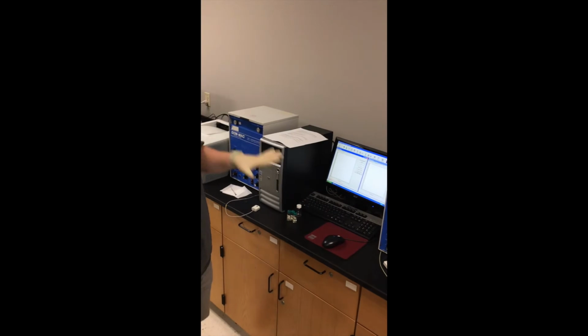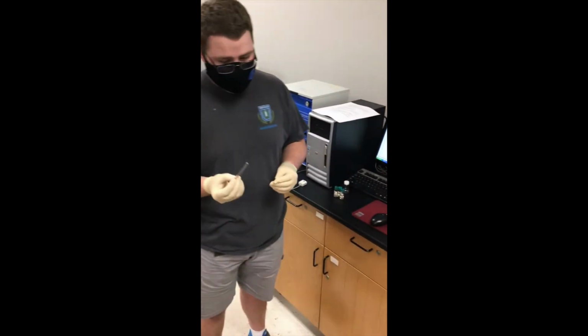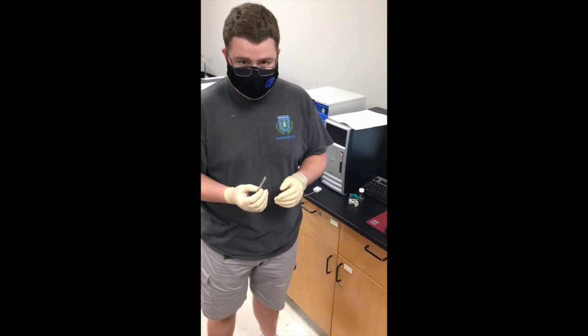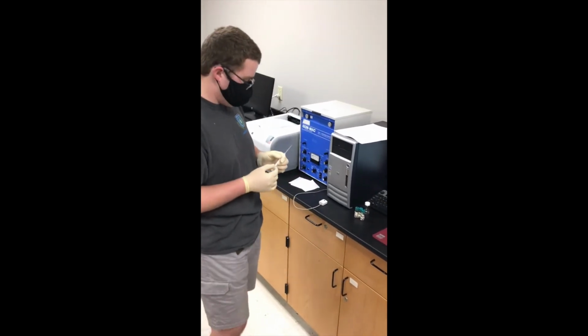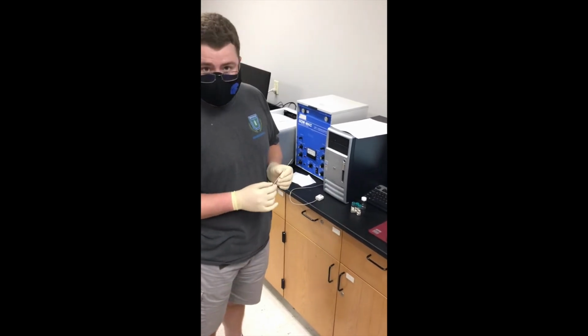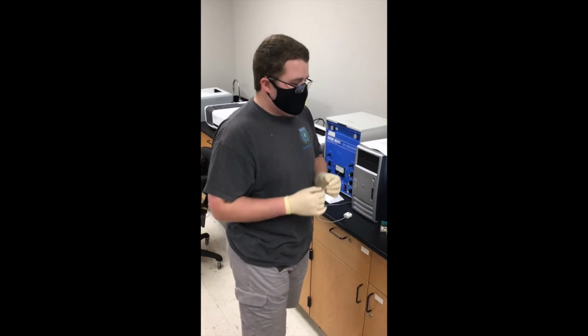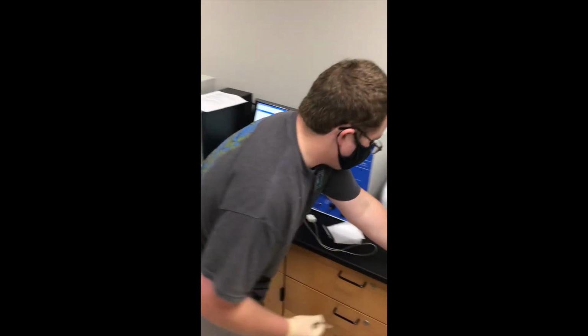Now, to actually inject a sample into the GC, you're going to be using a special kind of syringe called a micro syringe, and it's just like a traditional syringe. It's very sharp on the end, like a needle from the doctor's office, so be very careful when you're working with one of these. These are made for picking up very, very small volumes of liquid. In fact, I believe this is rated to 10 microliters. Yes, it is. So it only picks up a very small amount.